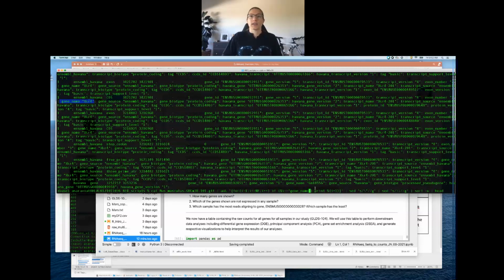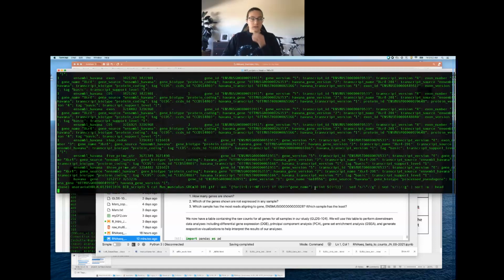But I'm arguing that if there are multiple gene IDs mapping to the same gene name, should we have more, less, or the same unique gene names? Less, yes, Zinru.